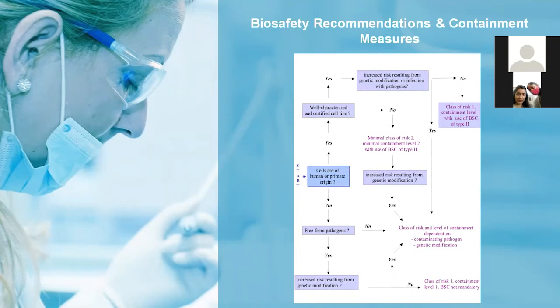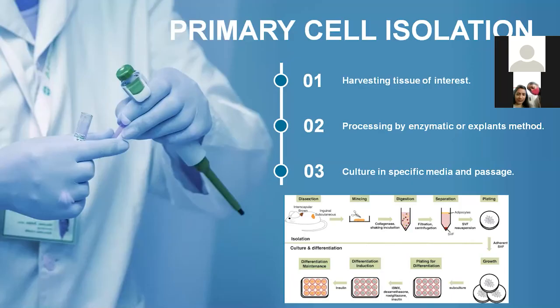Certain regulatory authorities have proposed that animal cell culture should never be manipulated in a biosafety cabinet with horizontal laminar airflow. Previously, horizontal laminar flow was used mostly for culture work like media preparation or media changes. However, we are not supposed to do any primary cell work in a horizontal biosafety cabinet because it does not protect you from the risk associated with primary cell culture.